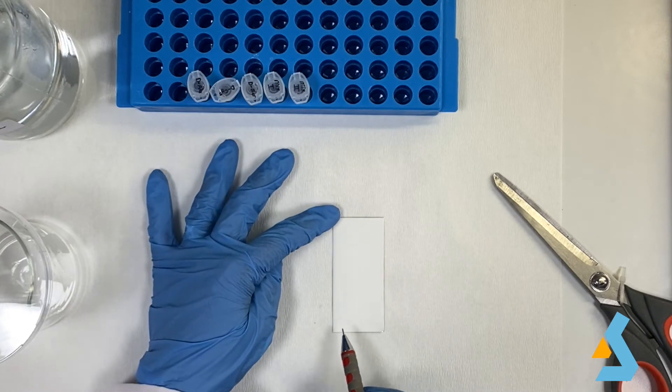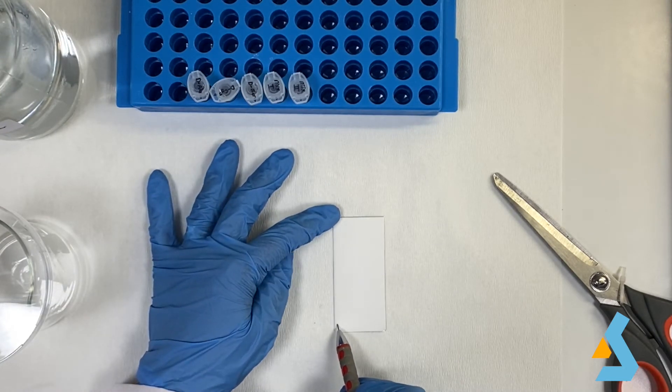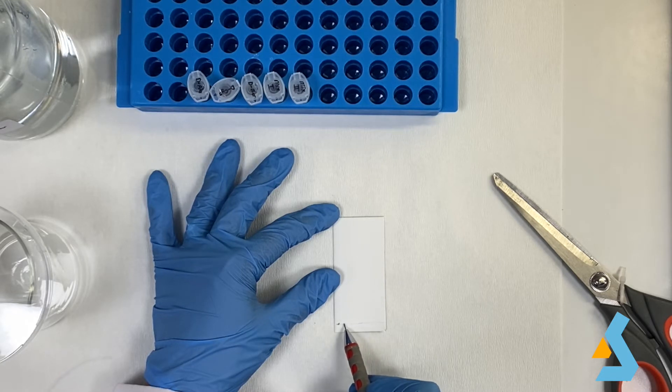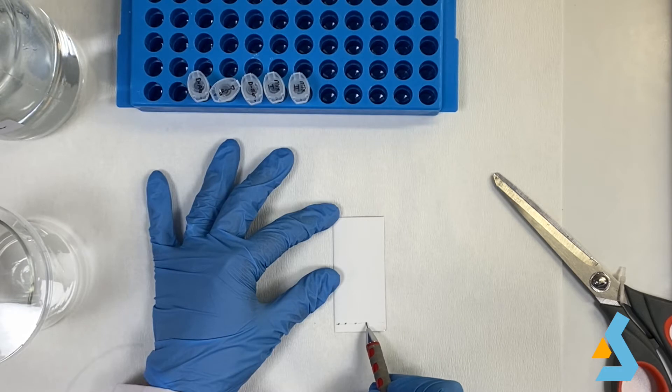We always use a pencil to mark the TLC plate because the ink in pens is soluble. Spots in which the samples will be loaded should not be very close to each other, because in that case, samples may overlap. Also, in order to eliminate the effect of evaporation, spots should be distanced from the edges of the plate.